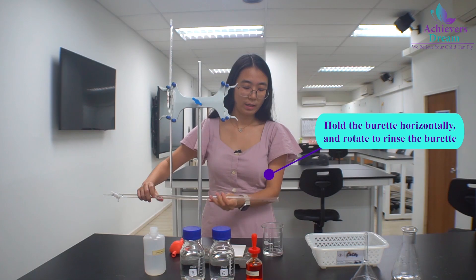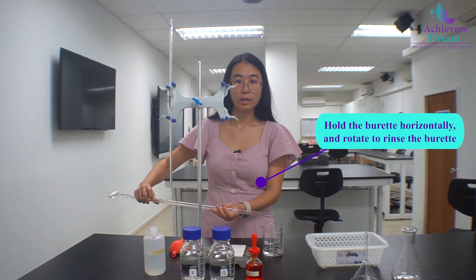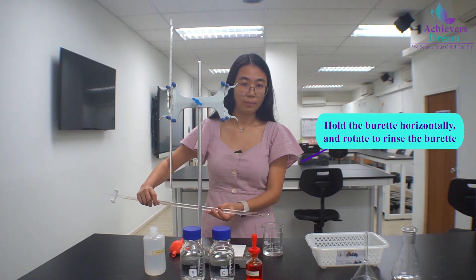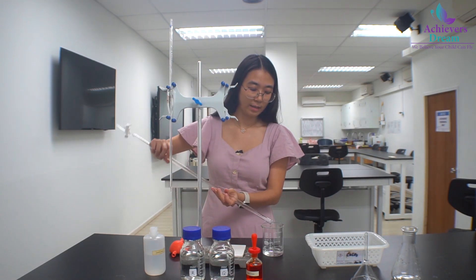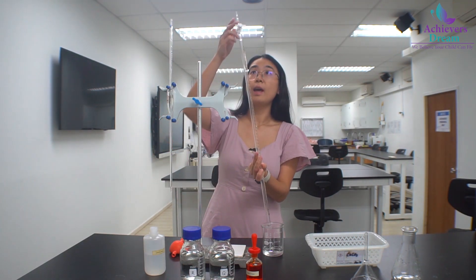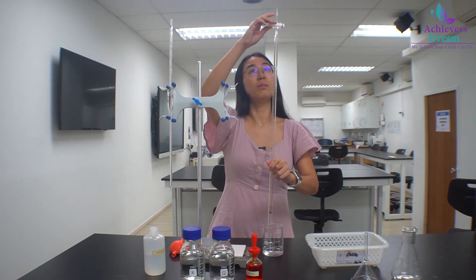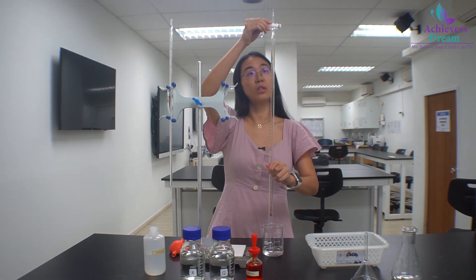Then hold the burette horizontally and rotate it so that the distilled water contacts all parts of the internal wall. After that, we can discard the distilled water. And lastly, remember to discard the water from the tip as well by opening the stop cock.